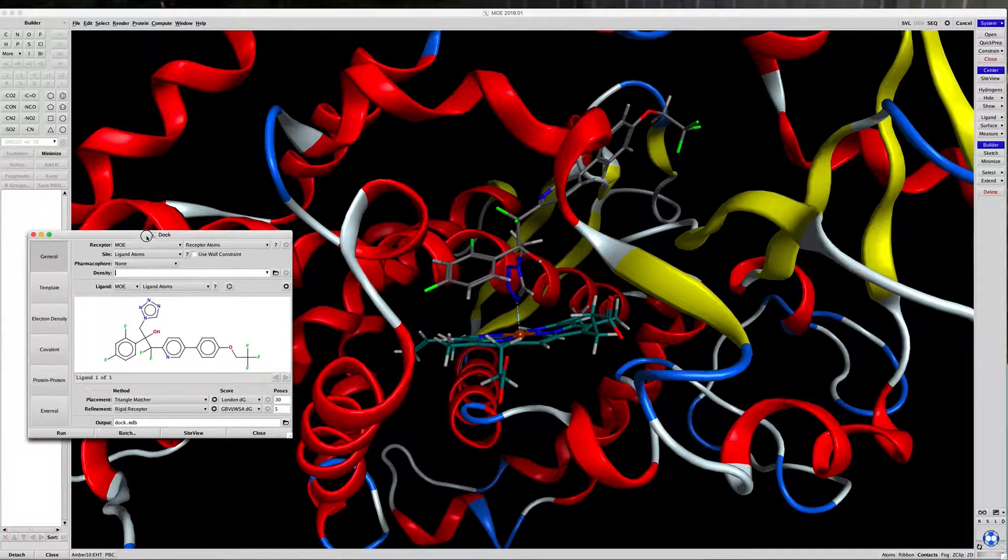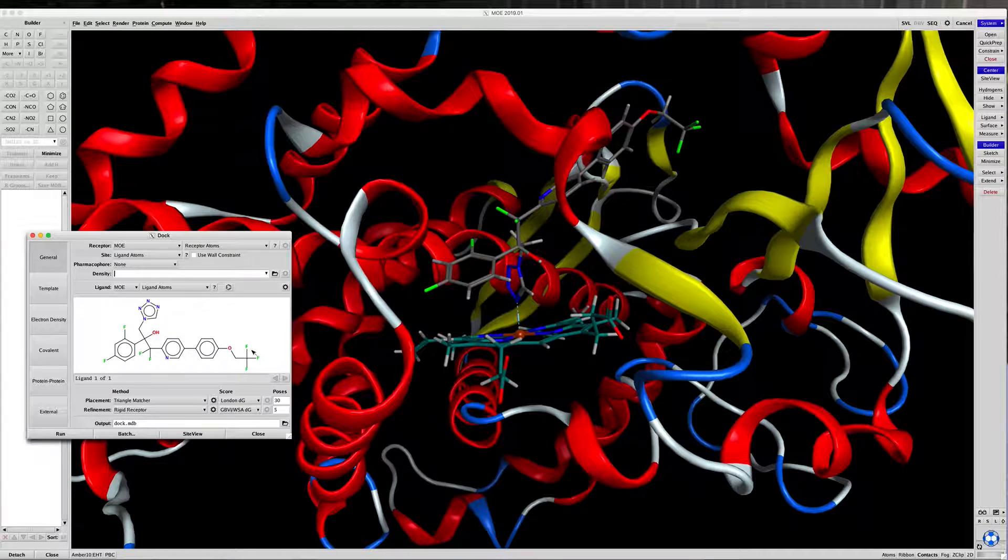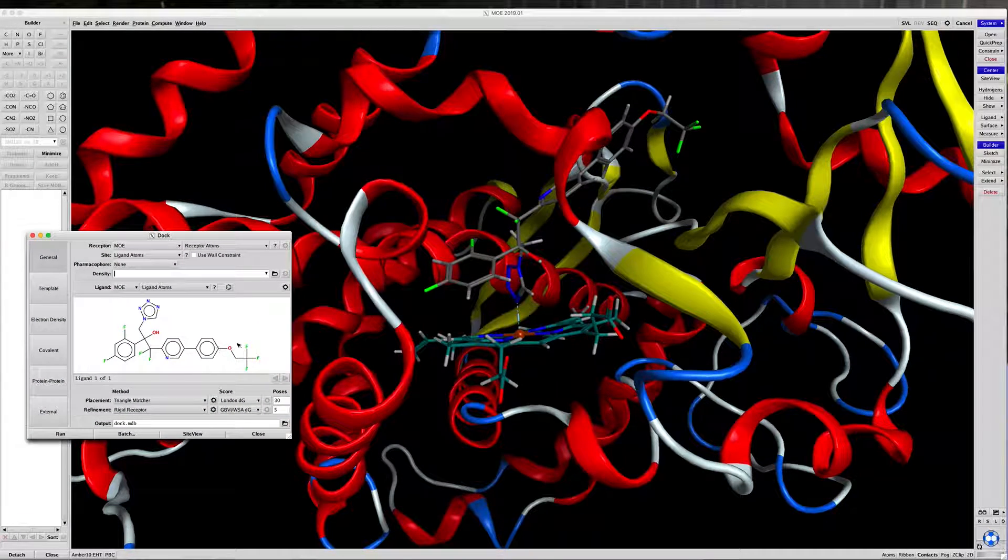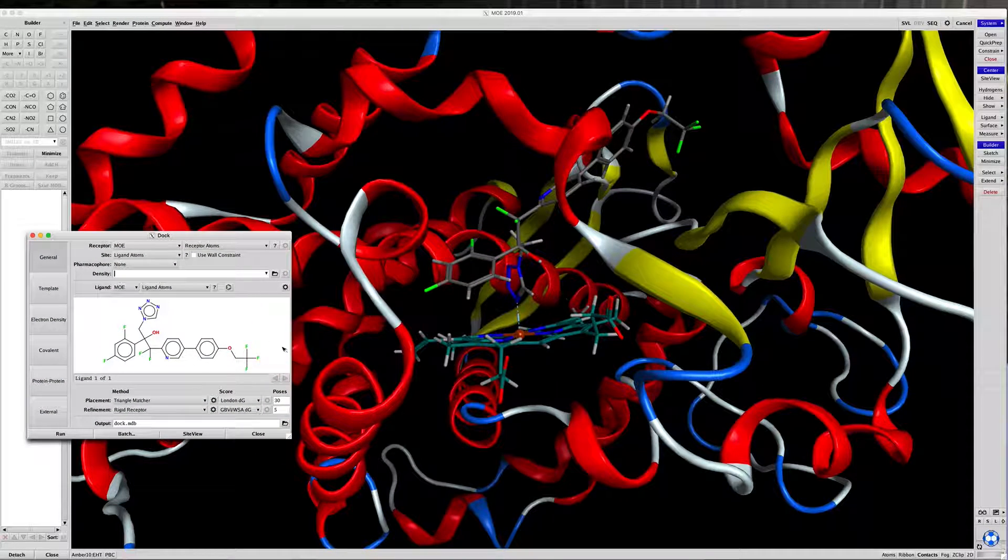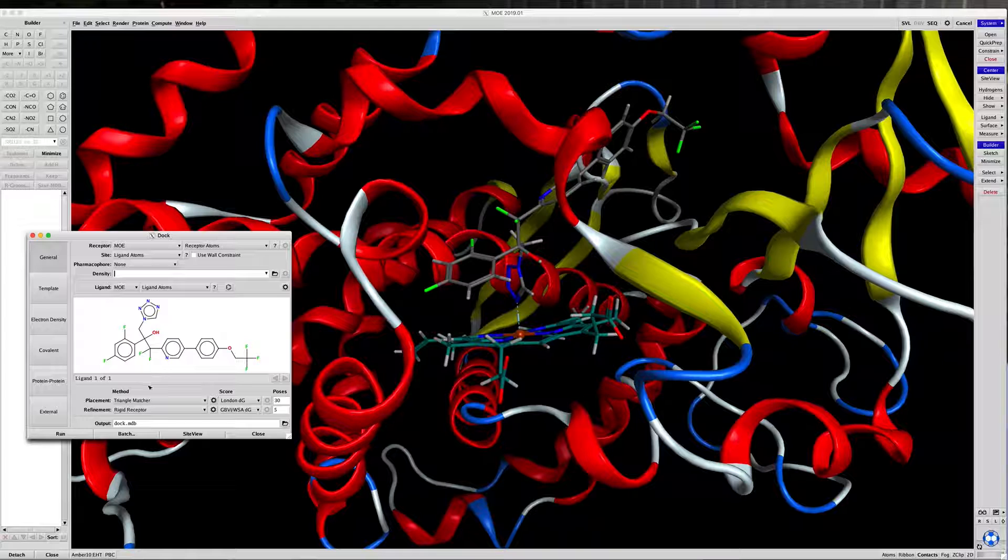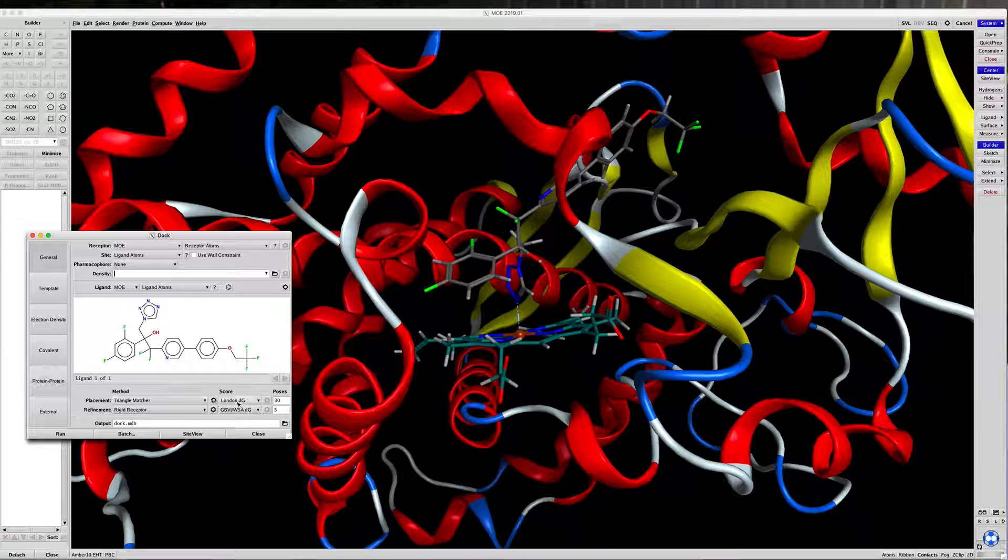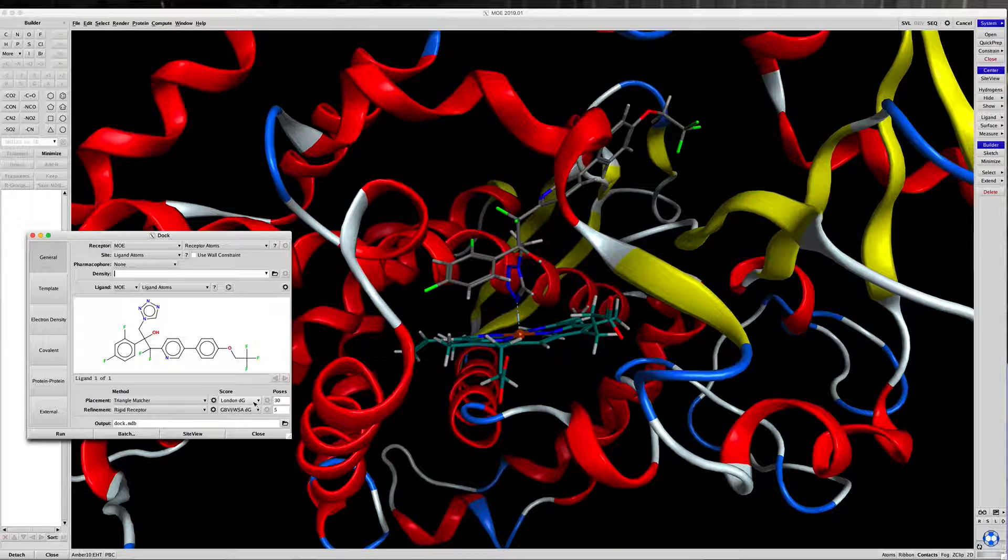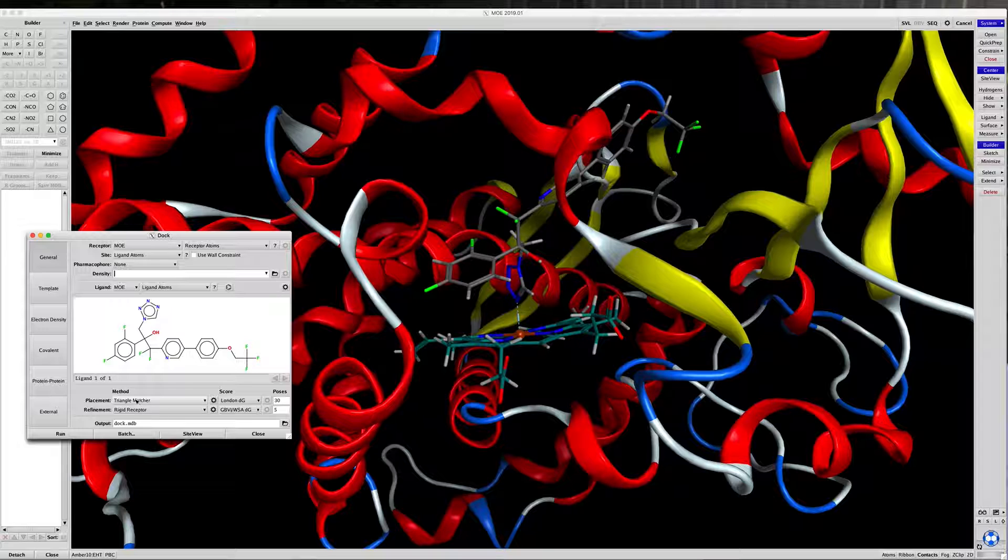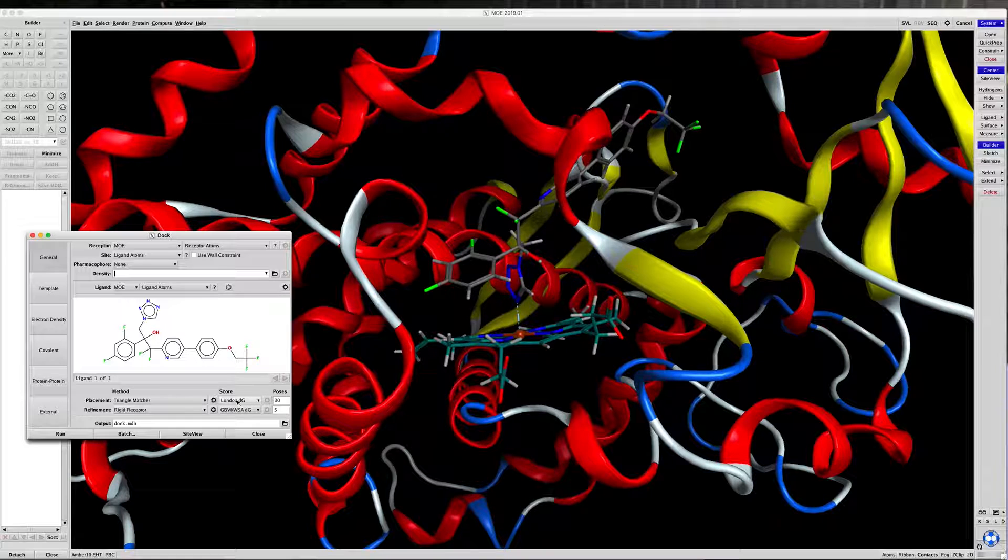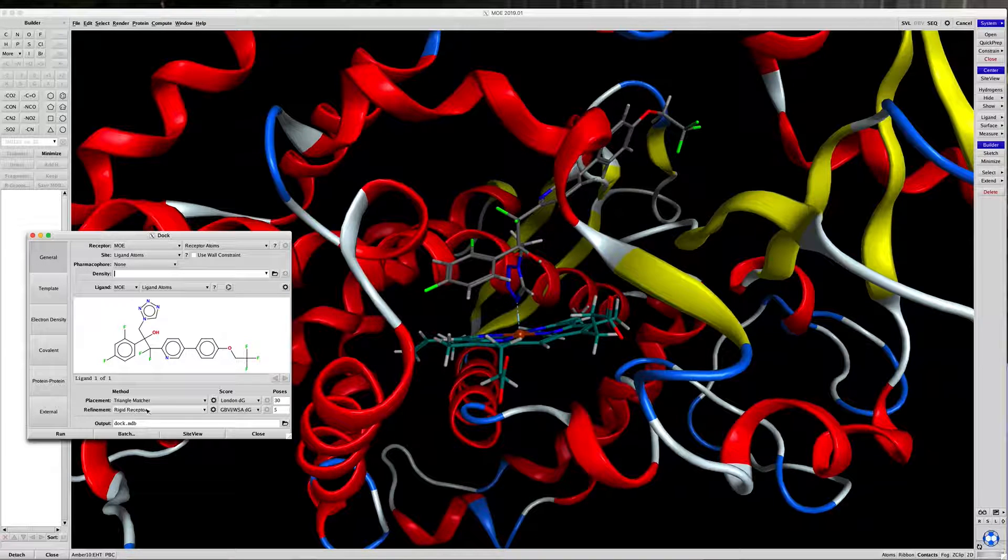The ligand present is the one we're going to dock. There are multiple things you can play with in this window. Placements, the scoring, the refinements.